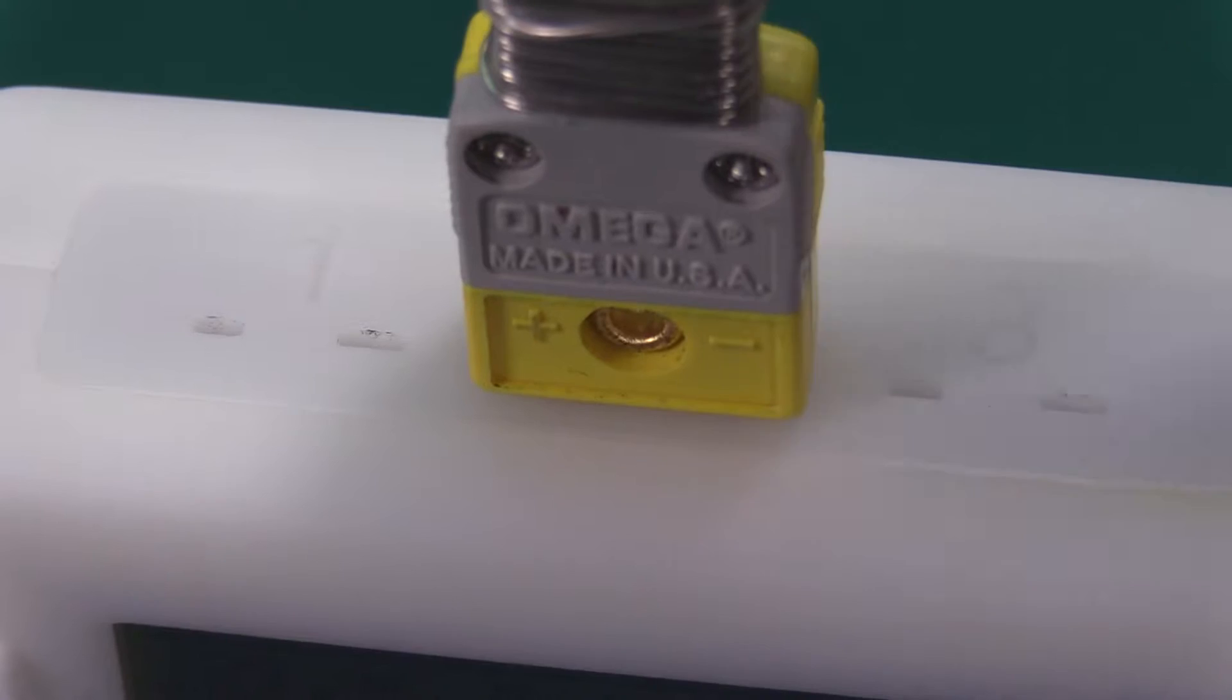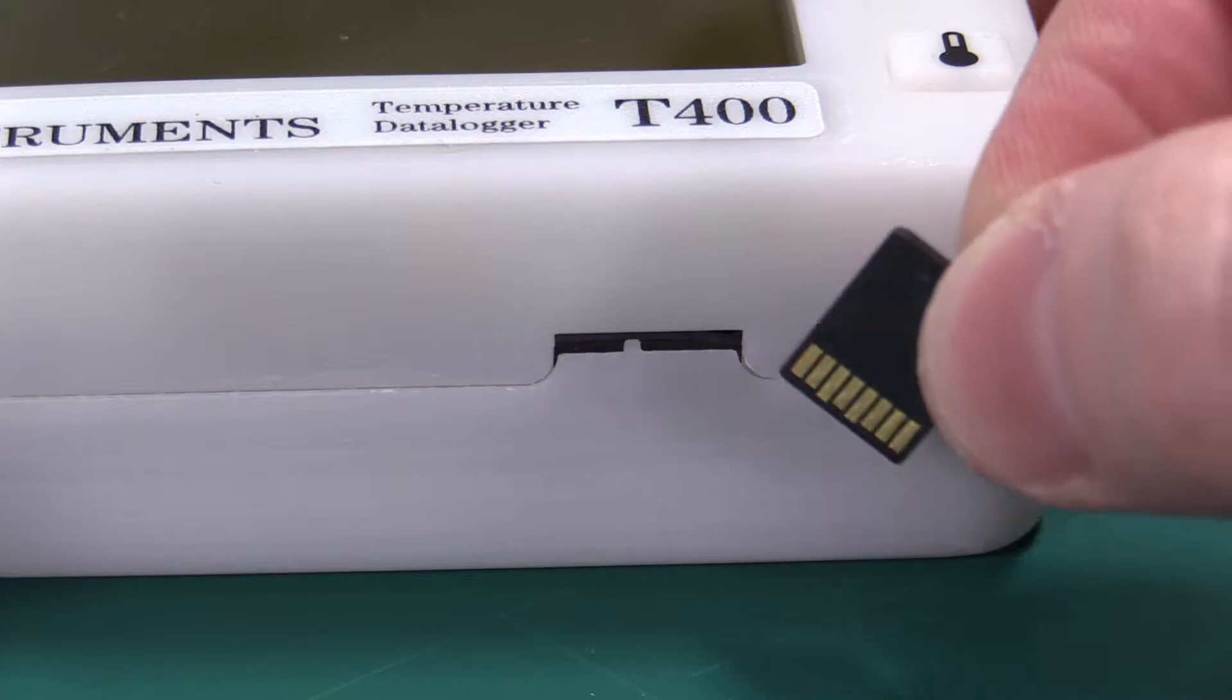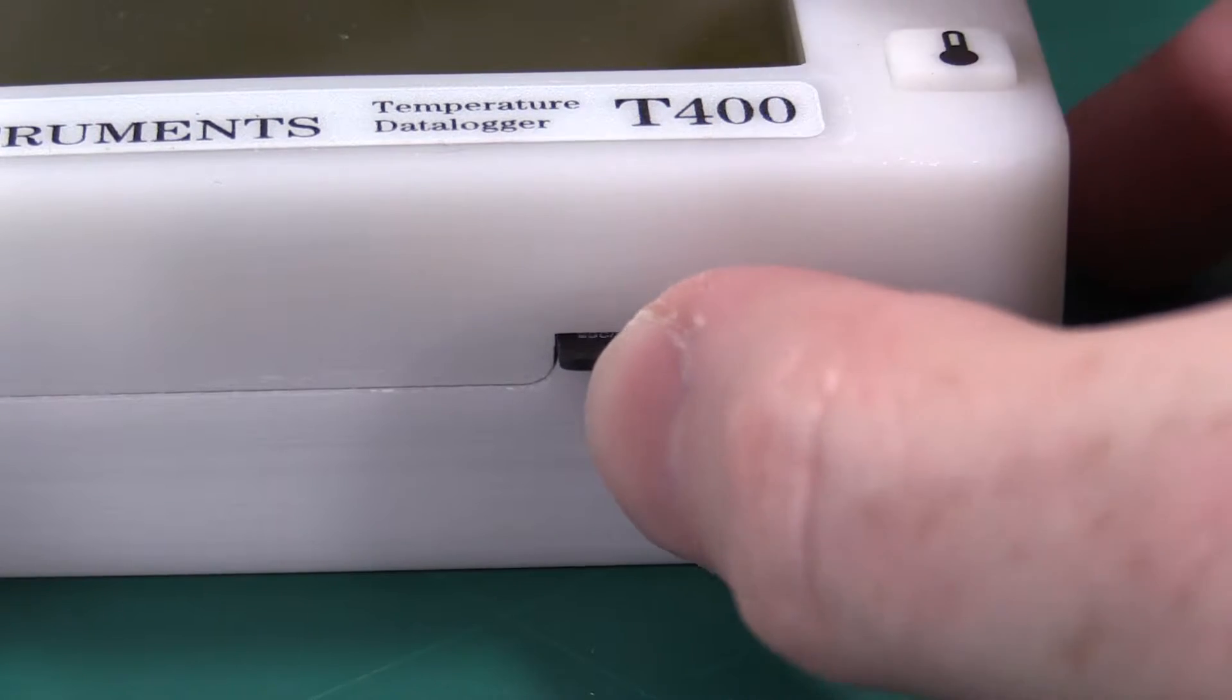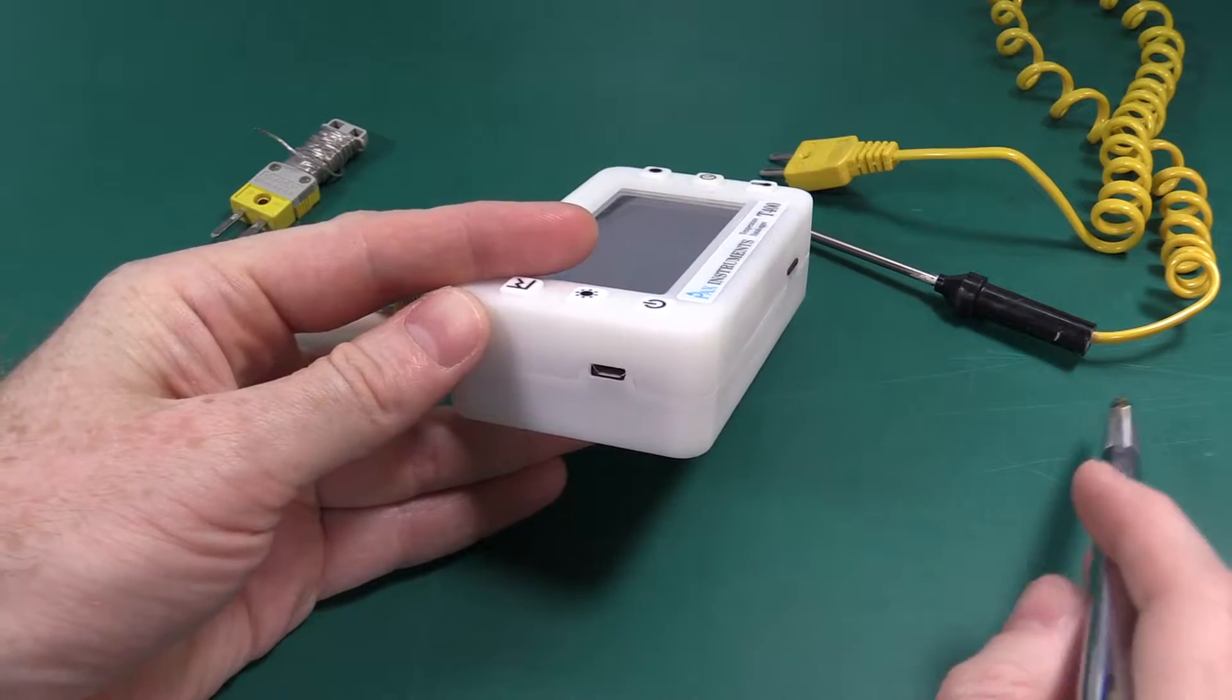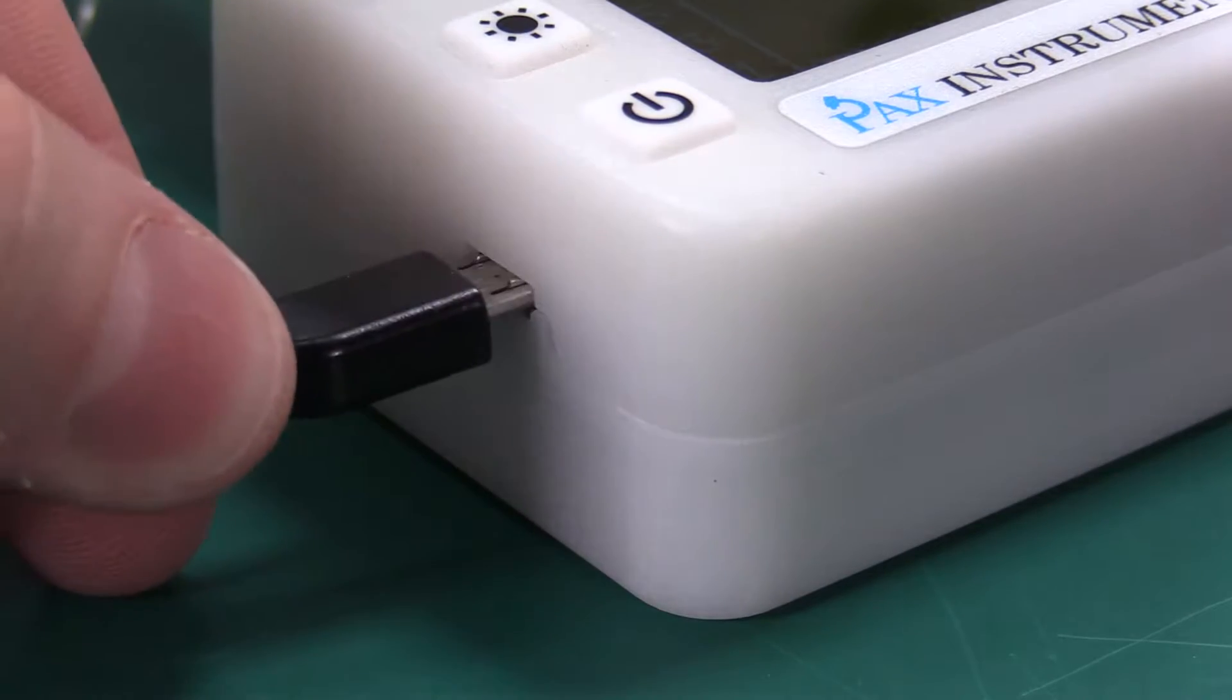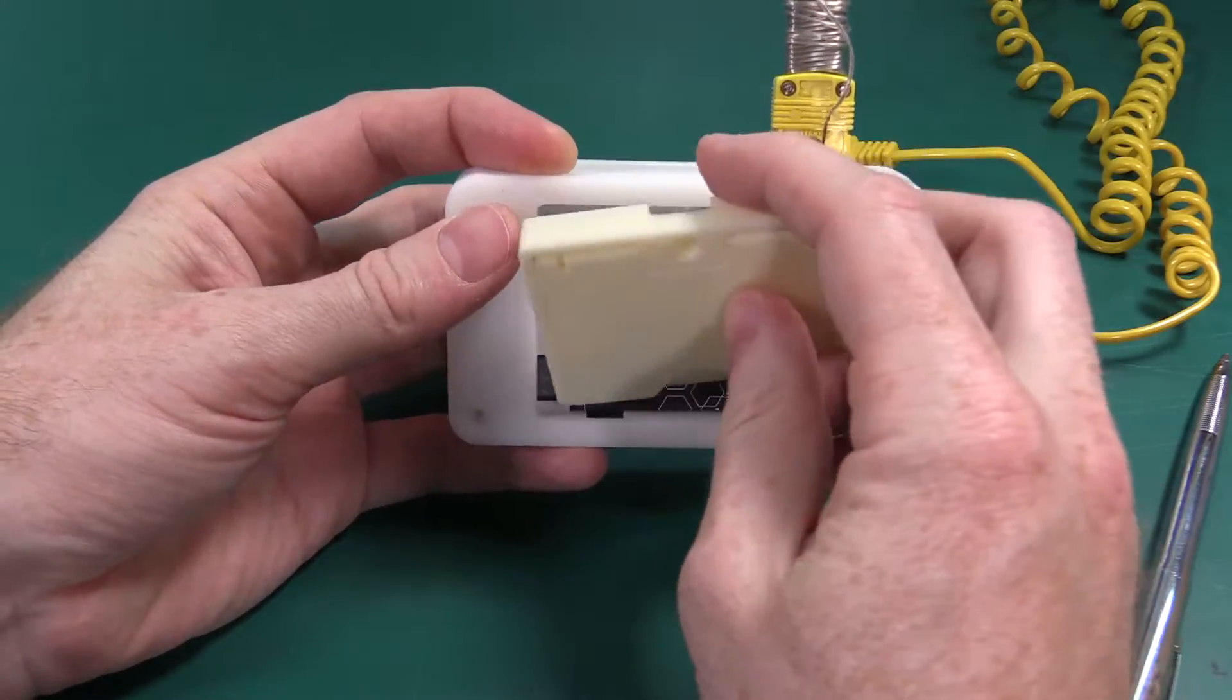It also has a micro SD card for saving files to standard CSV format and micro USB for connecting as a serial port to your computer and for recharging the internal battery.